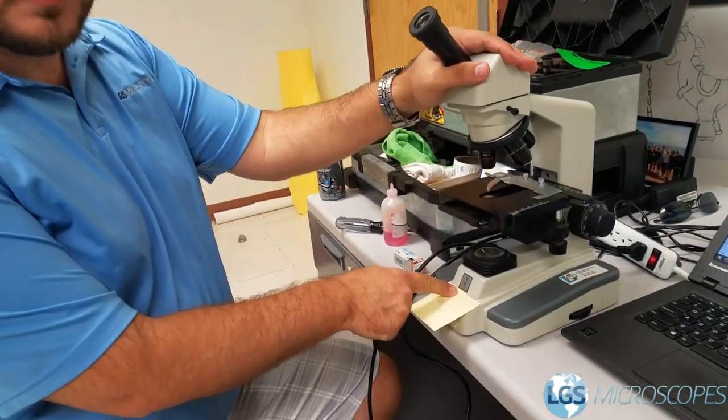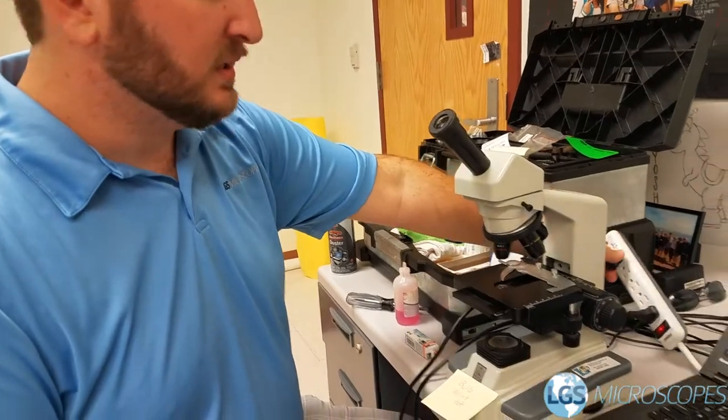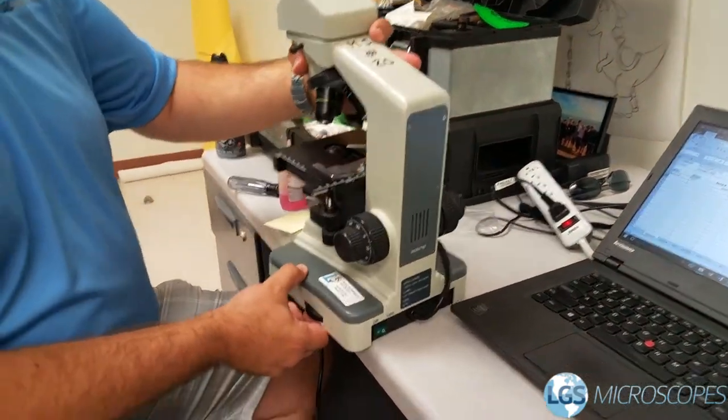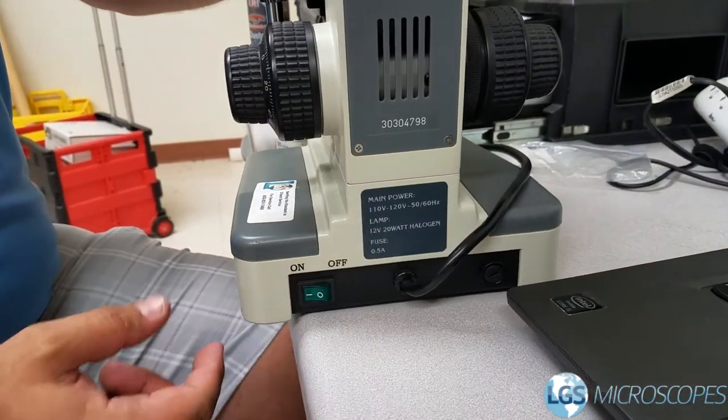This microscope has the bulb burned out and they were kind enough to label that for us. The first thing you want to do is make sure it's unplugged. Here on the back, a lot of times it'll tell you what bulb you need — this one needs a 12 volt 20 watt halogen bulb, G4 style.